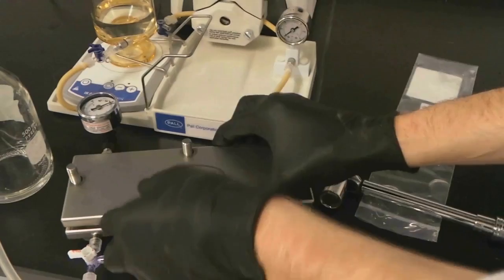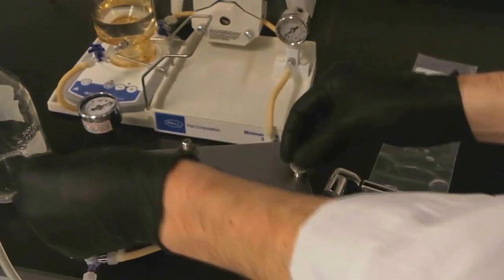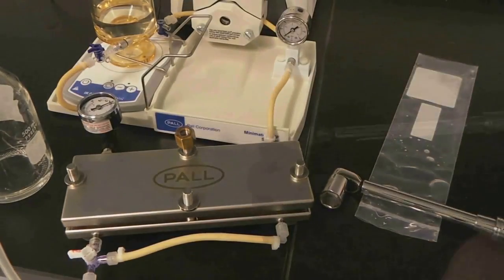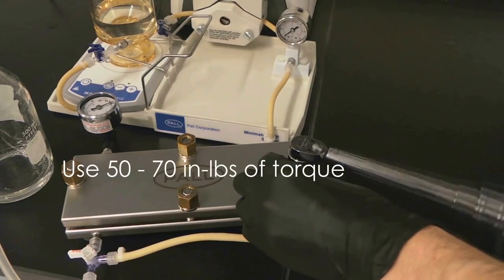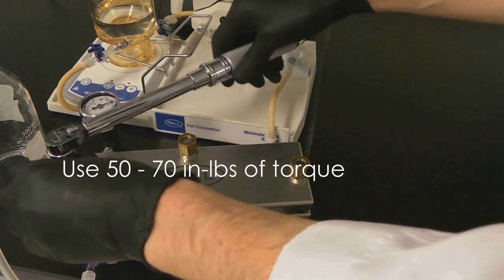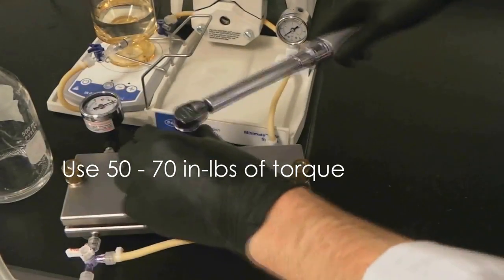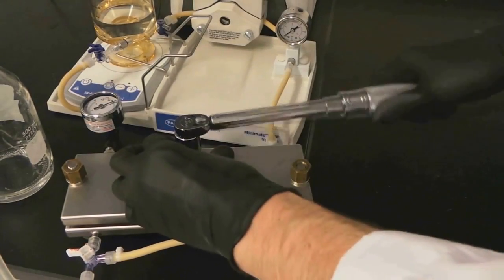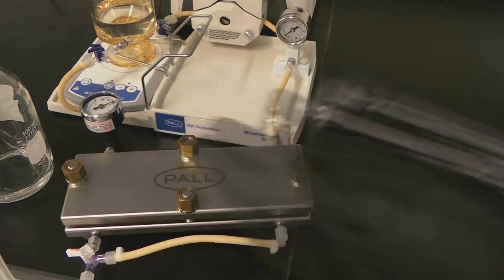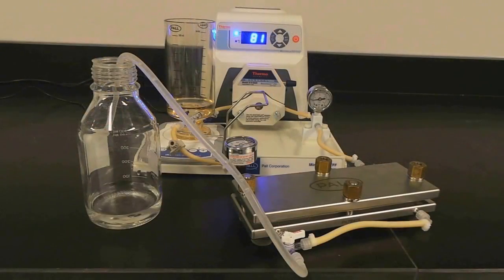And place the top of the holder back on the LV Centramate, along with the washers and nuts. With the nuts finger tight, use the torque wrench to tighten all of the nuts. Your LV Centramate can now be run.